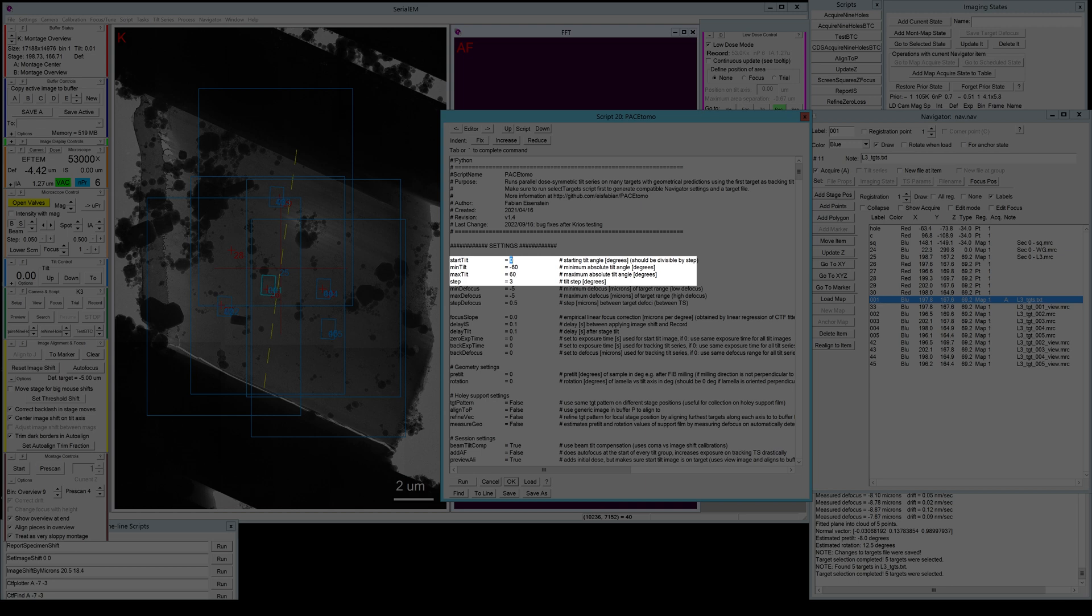For the start tilt, what you usually want to do is compensate for the pre-tilt of the lamella, so you actually start where the lamella is thinnest effectively. And of course, PaceTomo collects symmetric tilt series. So let's set this to not minus but plus nine degrees because the pre-tilt we measured last time was minus eight and it has to be divisible by the tilt step which is three degrees in my case.